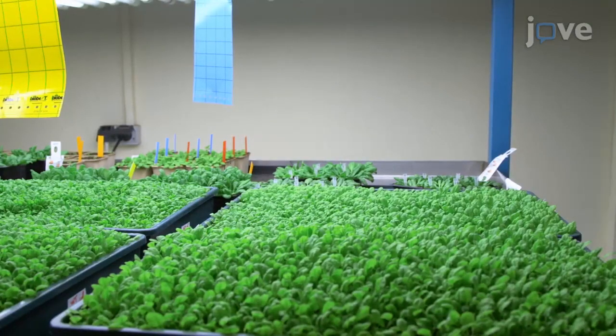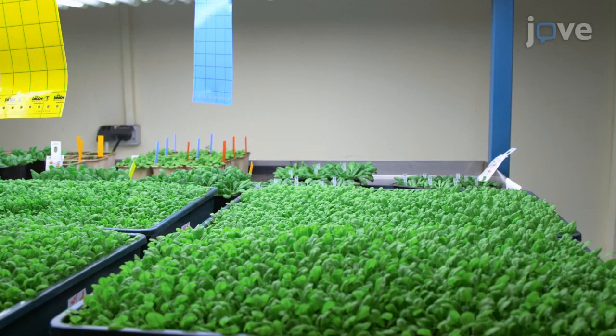To begin, grow Arabidopsis plants for five weeks with a 12-hour light cycle at 23 degrees Celsius in the day and 18 degrees Celsius in the night, with a light intensity of 150 micromoles per square meter per second.